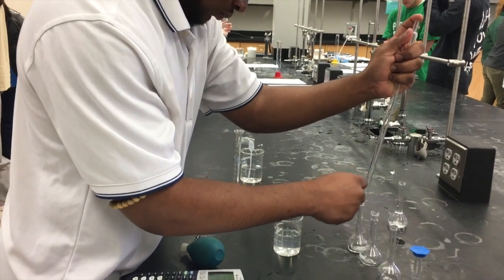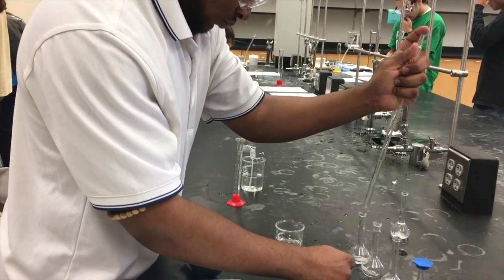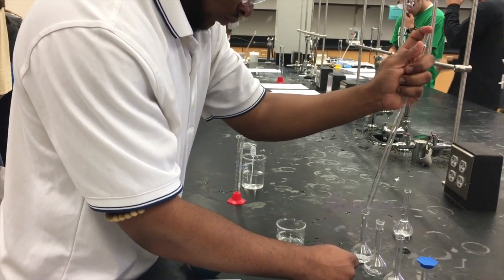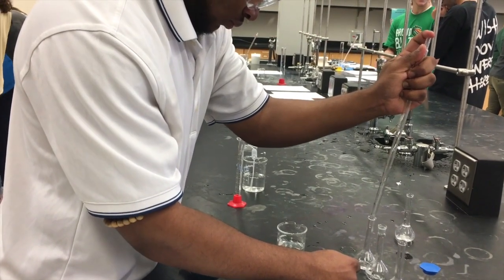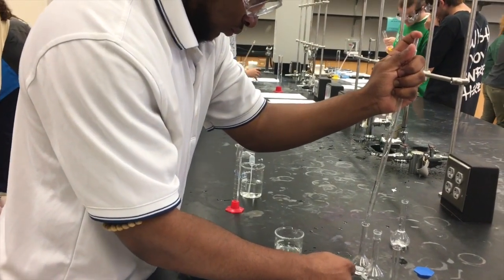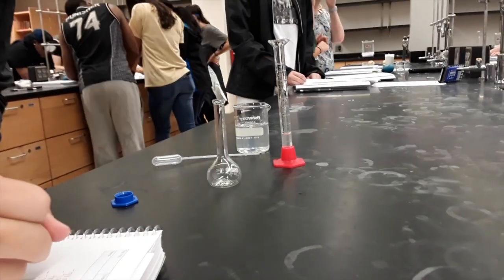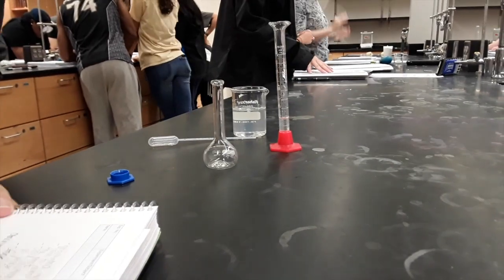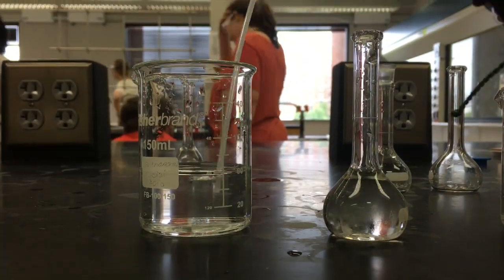After noting the initial volume of stock solution within the pipette, release some solution into the volumetric flask and note the final volume. To dilute the solution, you must pipette water into the volumetric flask until the bottom of the meniscus reaches the mark. Now you have your finished dilution. This solution is 7.45% concentrated.